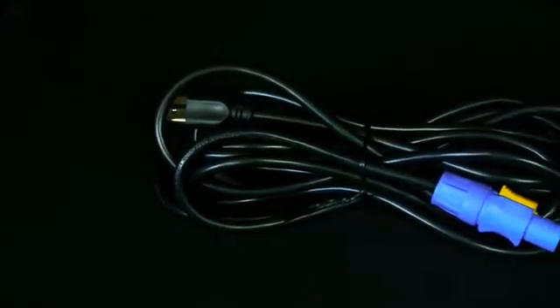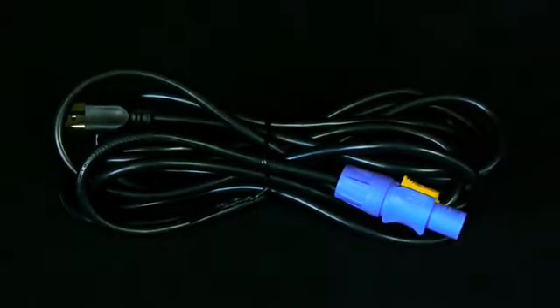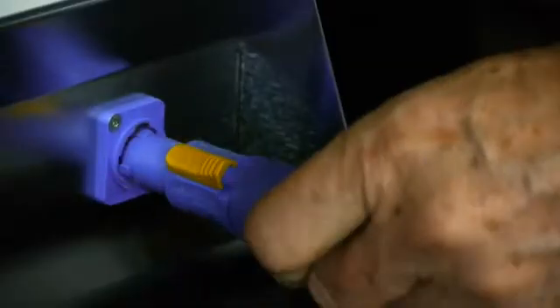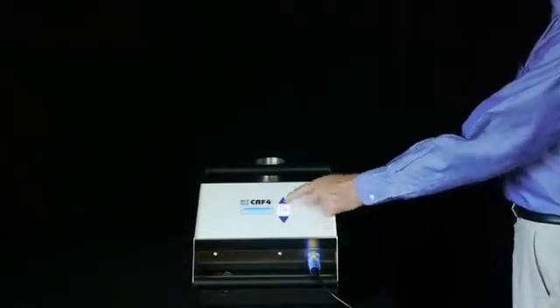Power is easily connected using a snap lock power cable, which connects your power at 115 volts AC for North America, or 220 volts at 50 hertz for Europe and Asia, or 100 volts at 50 hertz in Japan.